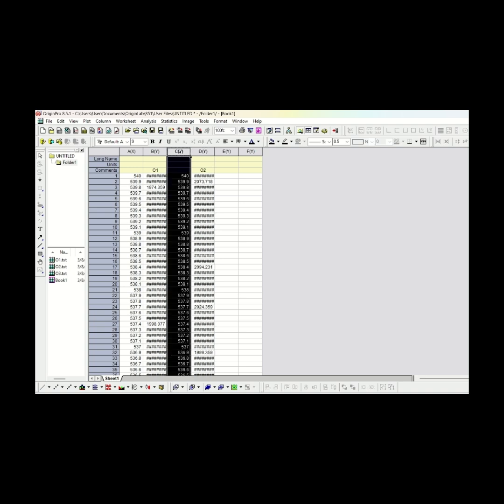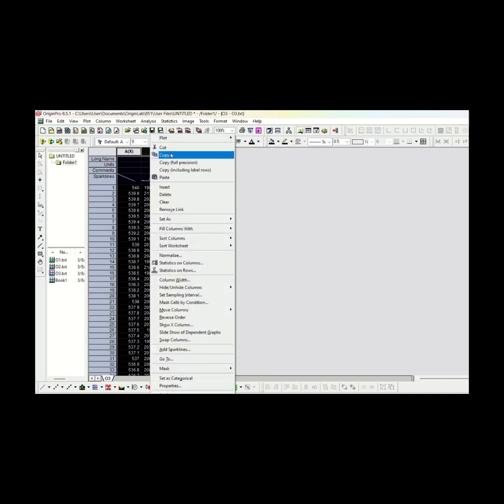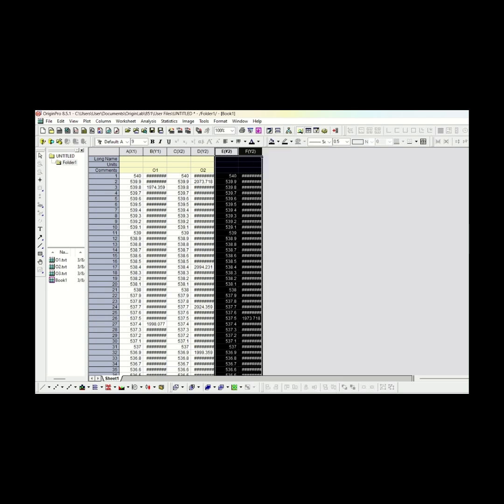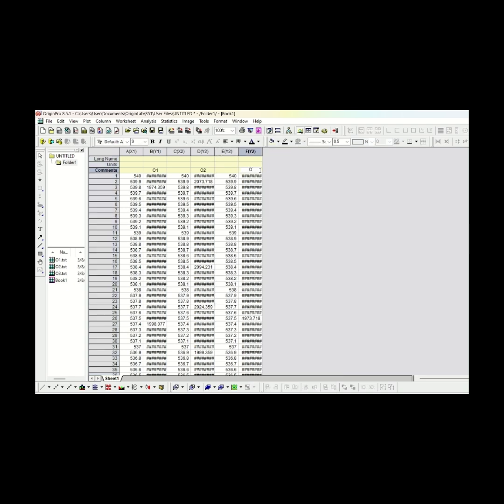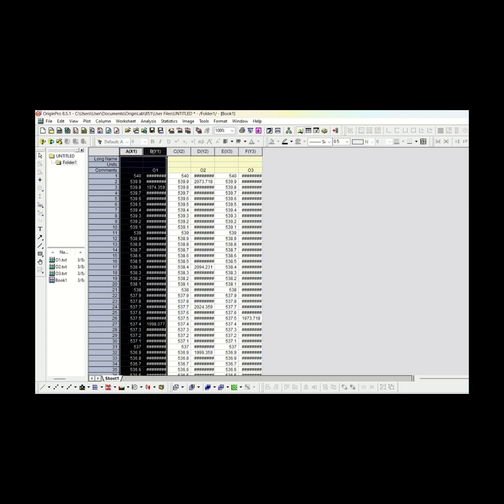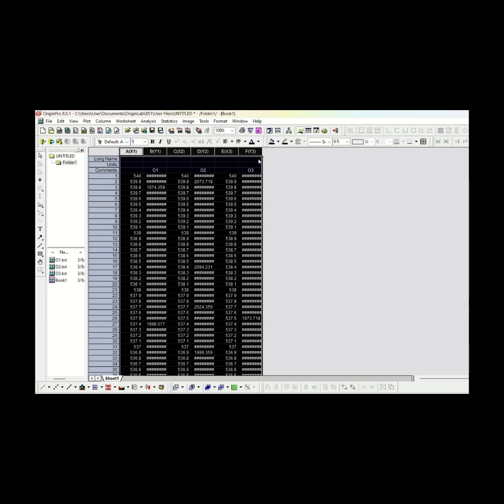Also, make the y axis, see y axis, into x axis. For that, you can right click and set as X. So it will be cy to cx axis. Similarly, copy the third data and paste. Write the name O3, make ey into ex, right click set as X. So we have three kinds of data: ax by, cx dy, ex fy.